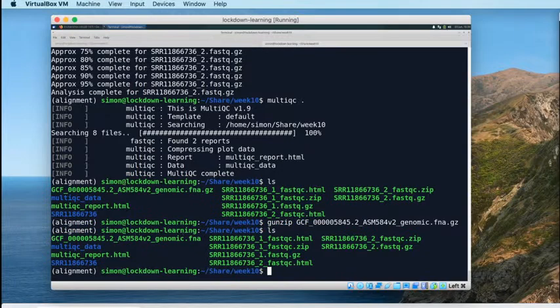fna.gz file to an FNA file. FNA meaning this is a FastA file for a nucleotide sequence. That's where the N comes from in there. So that's our reference genome, and we're going to index that using the binary which I mentioned before, Bowtie2 build. Okay, so Bowtie2 build is the binary for making our genome index.